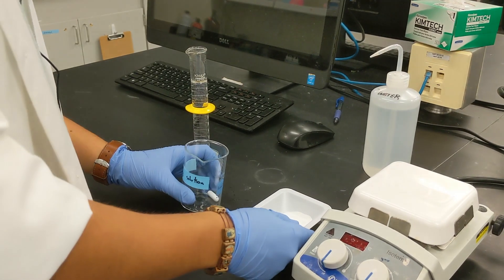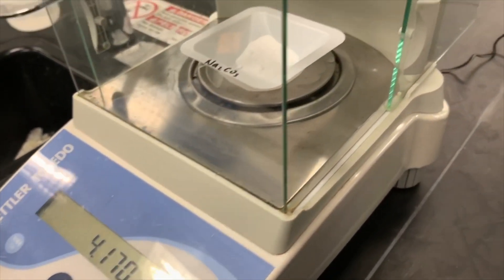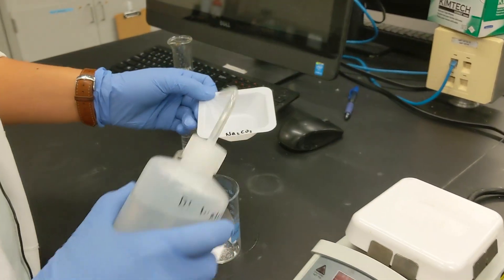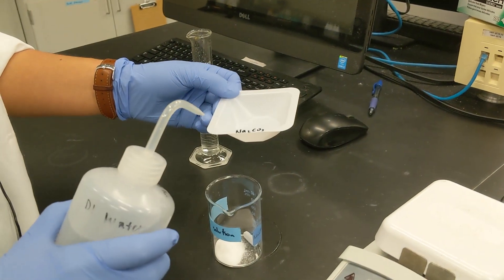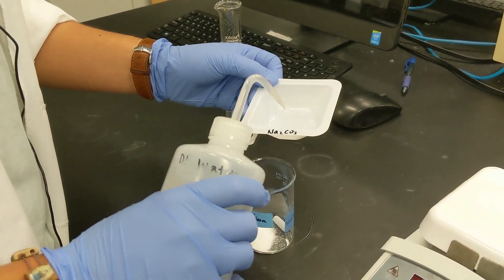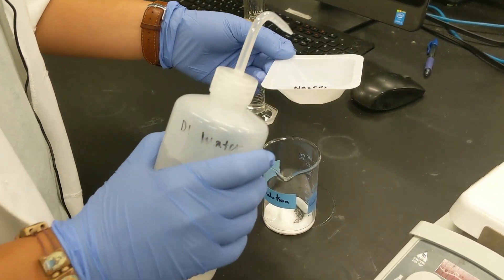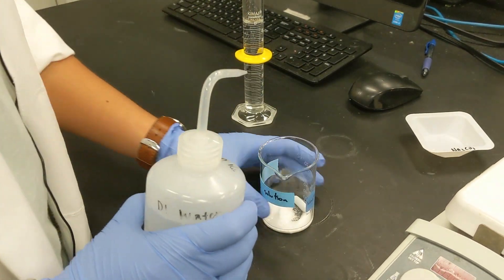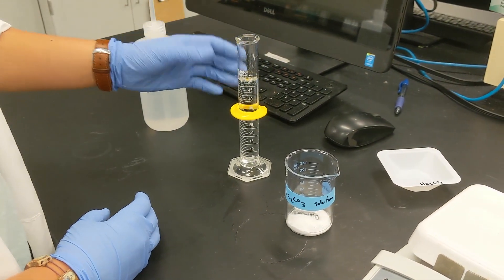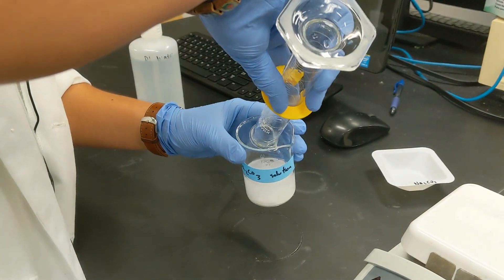Now all we're going to do is add our sodium carbonate from the weigh boat into this beaker and then we want to quantitatively transfer it. So that means there's still some solid in this weigh boat, so using this DI bottle we can squeeze out some and get some of the remaining solid into the beaker. Then we're going to add our 50 milliliters of DI water from this graduated cylinder and add it to the beaker.